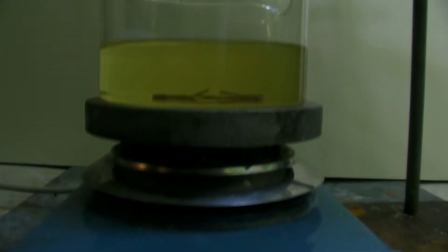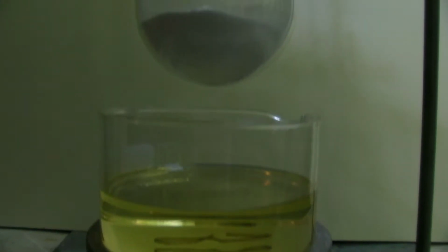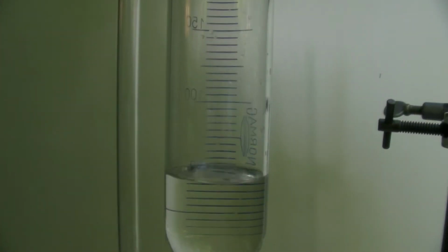In the experiment, the setup was made of a distillation apparatus with a dripping funnel. The flask contained phosphorus pentoxide and the dripping funnel contained sulfuric acid. Some might have already noticed that there is a problem. Unfortunately, I noticed it too late.